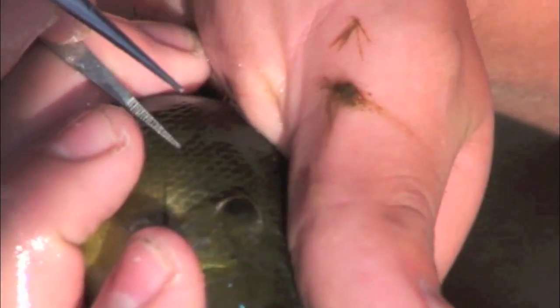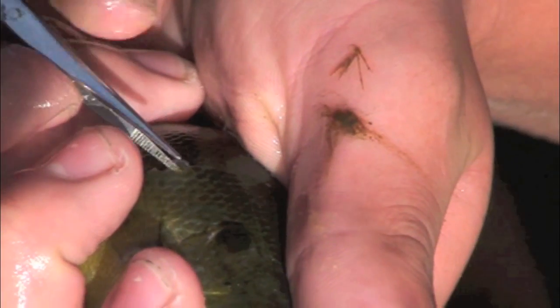Now use your tweezers to gently remove three to five scales from behind the pectoral fin on each fish.